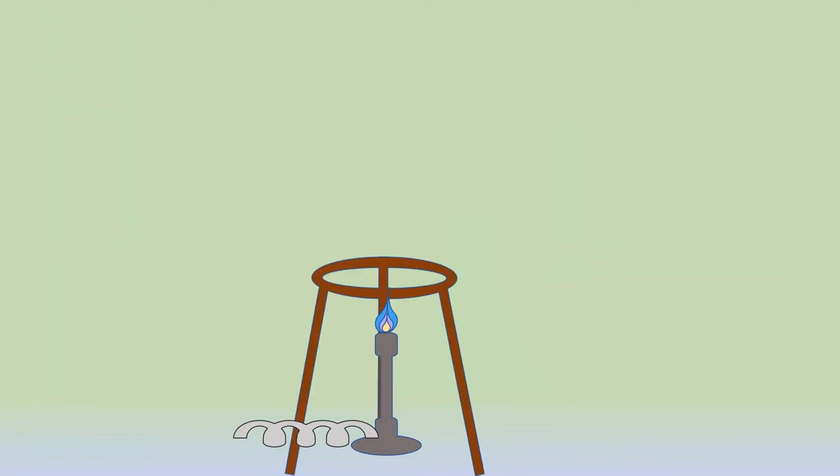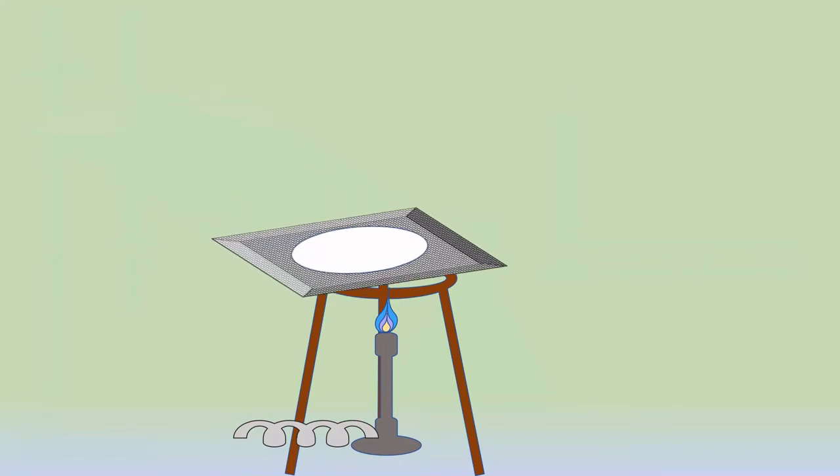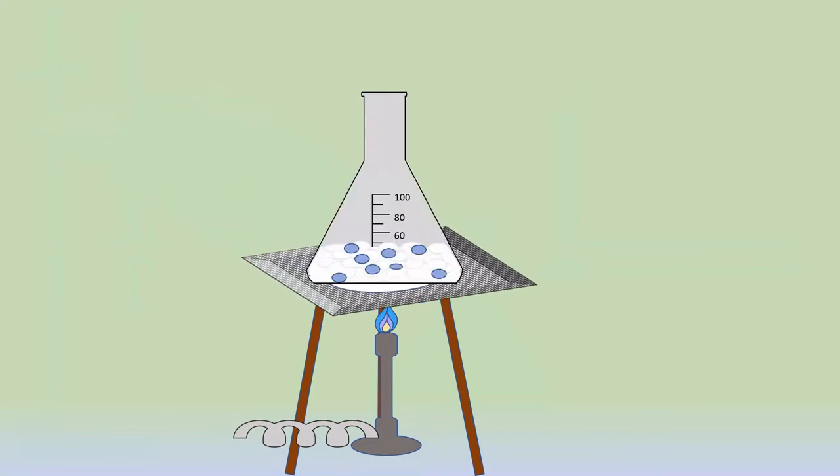Next, we are going to do the heating part of this reaction. So for the heating part, what do we need? We need a burner. On that you will put the wire stand, and on that you will keep the wire gauze. And the conical flask, which is containing 1 ml of ethyl benzoate, 10 ml of 10% NaOH, and the 3 to 4 ml of water we added. So this is your conical flask, and you're going to continue the heating. Now you can see, as you continue heating slowly, that white solid will start dissolving, and you will get a clear solution like this.